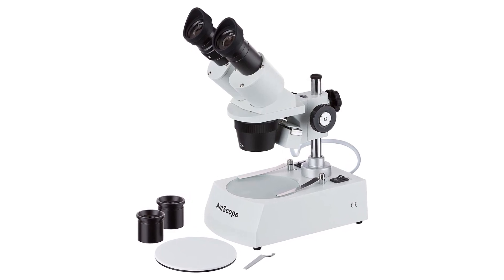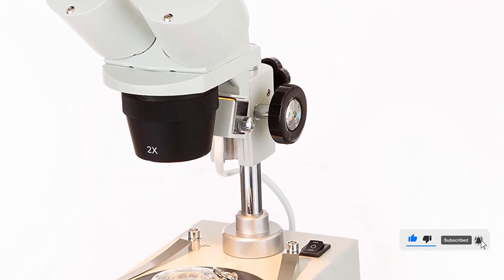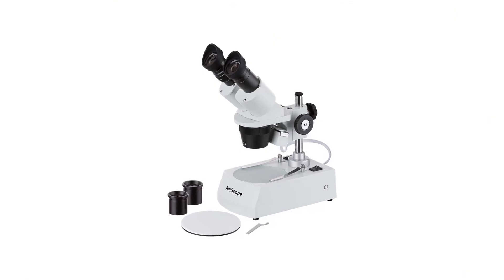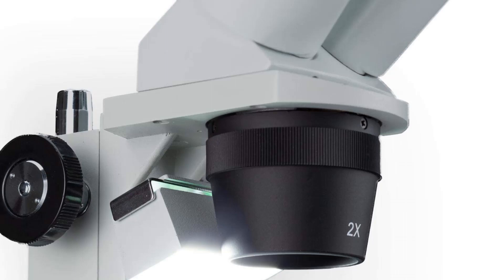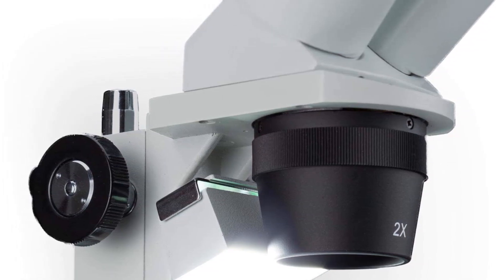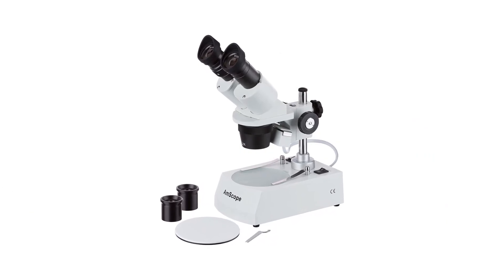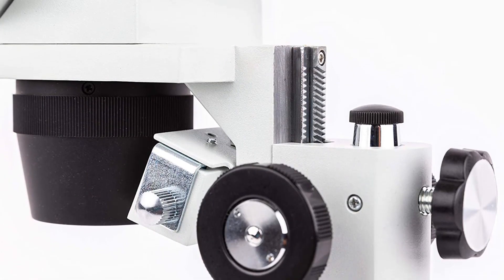Pros: binocular stereo microscope design provides 3D images with greater depth perception; WF 10x and WF 20x eyepieces with 10x to 80x magnification allow for detailed observation of specimens; 2x and 4x objectives provide greater levels of magnification; upper and lower halogen light sources provide bright illumination with shadows for better depth perception; pillar stand is stable and adjustable; and 120V power supply ensures reliable power.